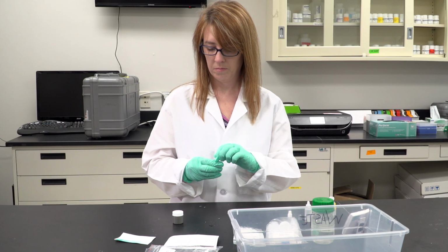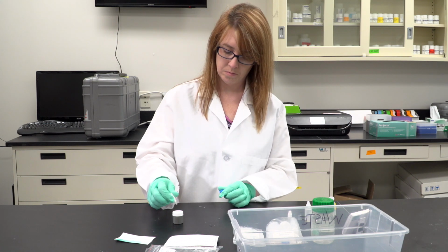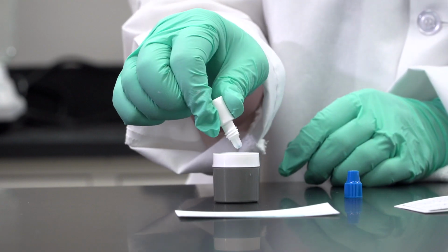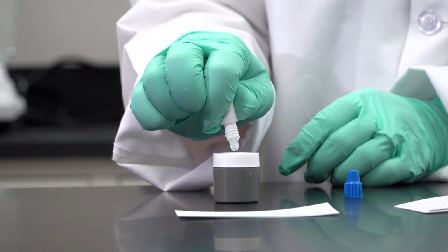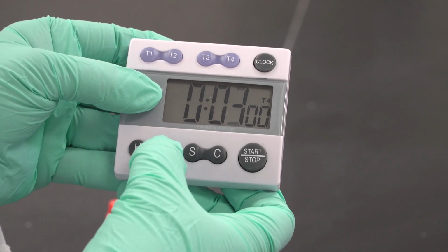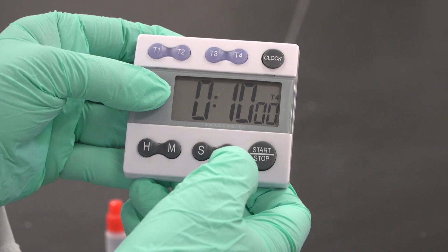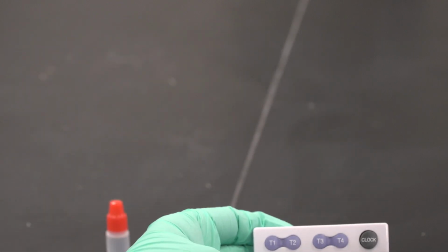Immediately begin timer according to the following: 60 to 69 degrees Fahrenheit, 15-minute incubation. 70 to 79 degrees Fahrenheit, 10-minute incubation. 80 to 89 degrees Fahrenheit, 8-minute incubation. 90 to 100 degrees Fahrenheit, 6-minute incubation.